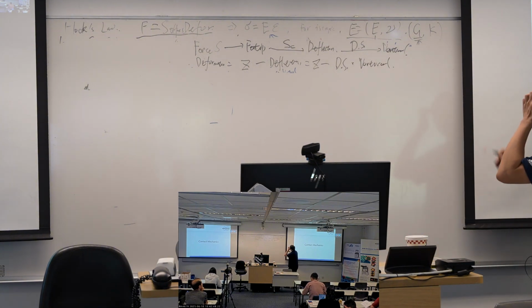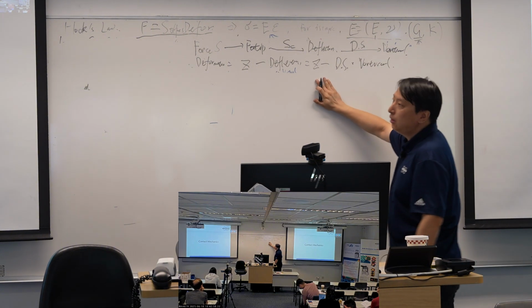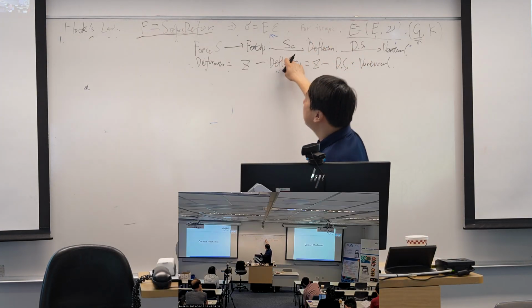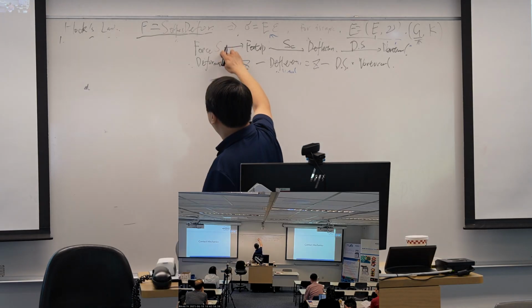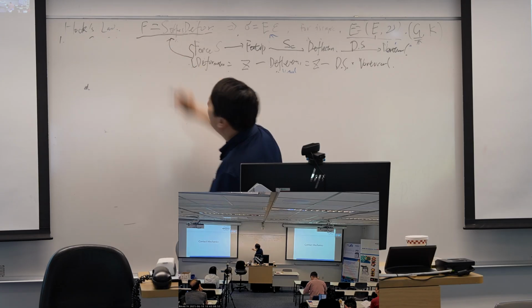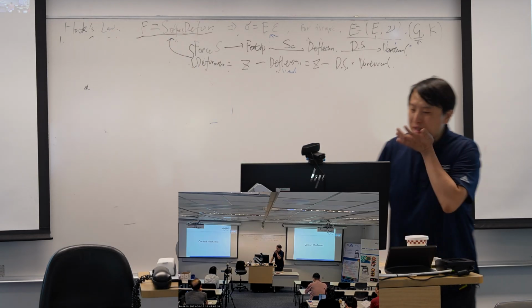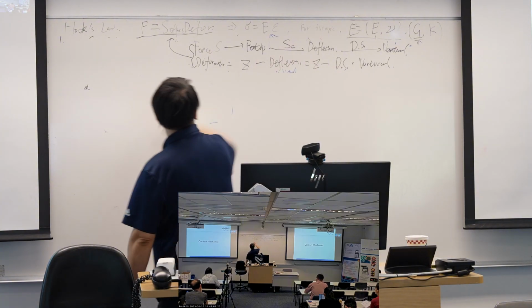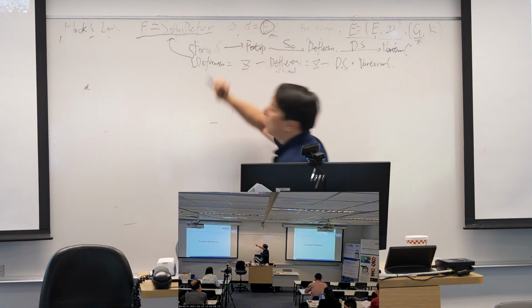So it's the same. We have the vertical, we have the Z, we calibrate the deflection sensitivity, we calibrate the spring constant, and finally we get the force, we get the deformation. And then from this, we can have the stiffness. And the stiffness, as we said, is not our holy grail. We still want the modulus out.